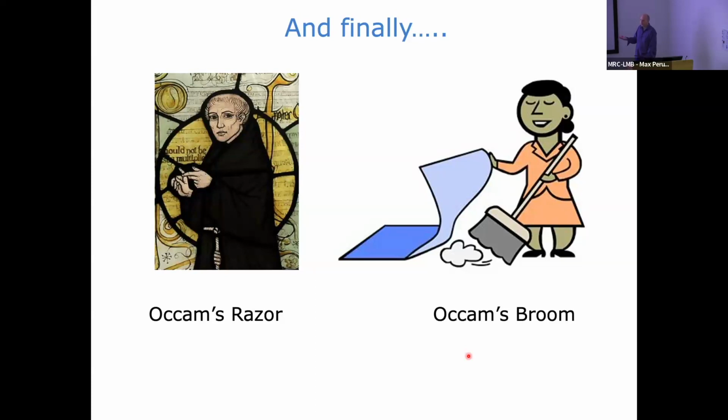Sometimes you do get confidence limits. In Prism, it will fit something, and I think ITC will give confidence limits as well, where it will say this is a KD, but the 95% confidence limit is between 2.4 and 6 or something. So in those circumstances, you could be confident that when you get a slightly different result by another technique, that's still within a good confidence limit. And if it's not? If it's not, go and repeat.